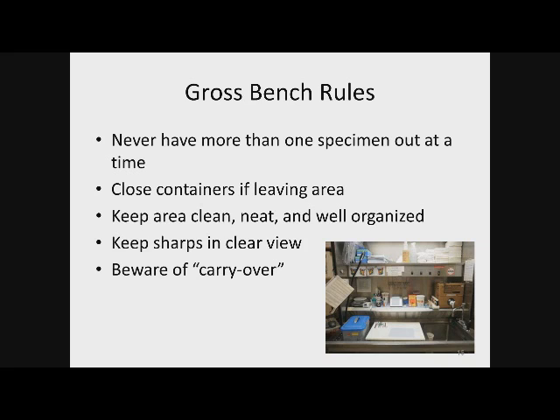And this isn't just for carryover, but it also has to do with the potential for safety hazards. There are many sharps on the gross counter. Typically, these are attached to magnetic holders, which can keep them in clear view, but it is important to keep track of all the sharps that are being used at any time just to limit that mechanical safety hazard.